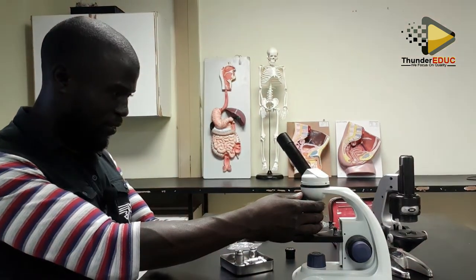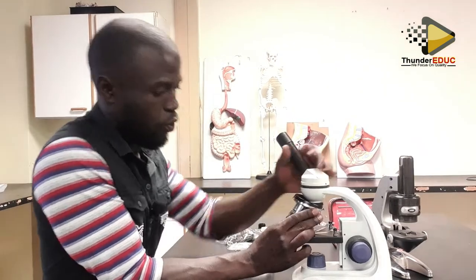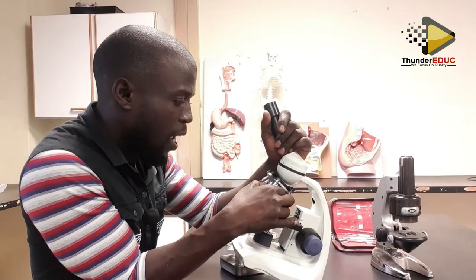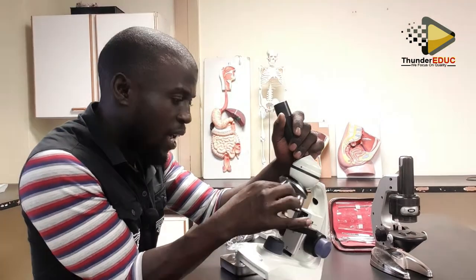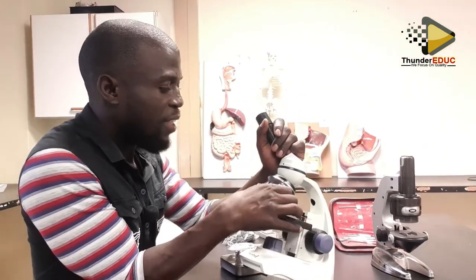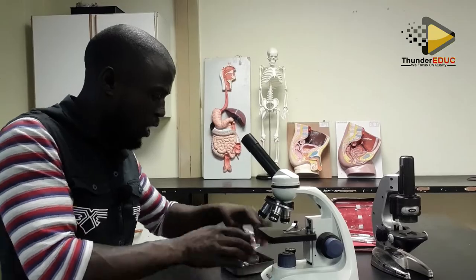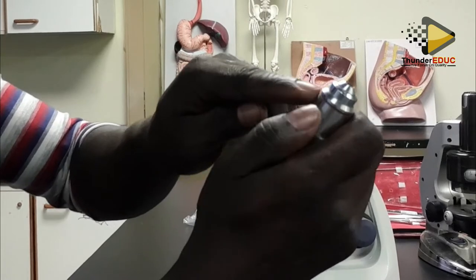Be gentle when you are putting it. All right. So these are what are called the objective lenses. They increase the magnification. If you look at them, this one is 40 times, this one is 4 times, and this one is 10 times. Sometimes we identify them by their colors. They have a ring which indicates the different colors.